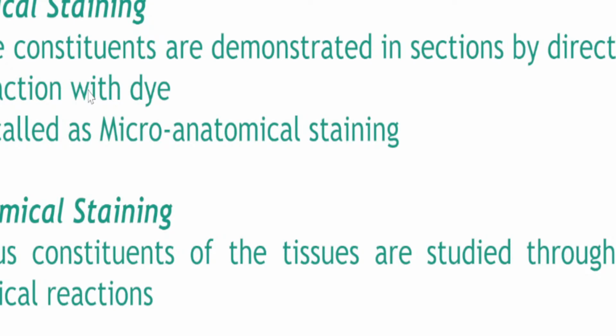Histological staining or microanatomical stain: tinapunan ko ng pintura si Mel, kung ano yung nakita nating stain, yun na yun. Okay? Histochemical stain: binuhusan ko ng clear na likido si Mel, biglang nag-color blue. Gets? Bakit?